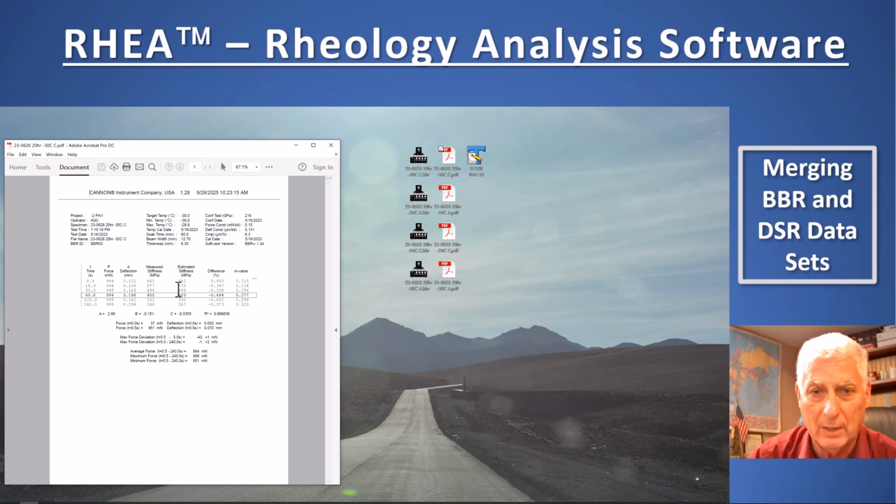And the normal way we construct master curves is to try to get a minimum of 5 data points to represent a decade of frequency. In terms of these data sets, we have about 3 data points per decade of frequency. So we have 2 ways of trying to approach this.